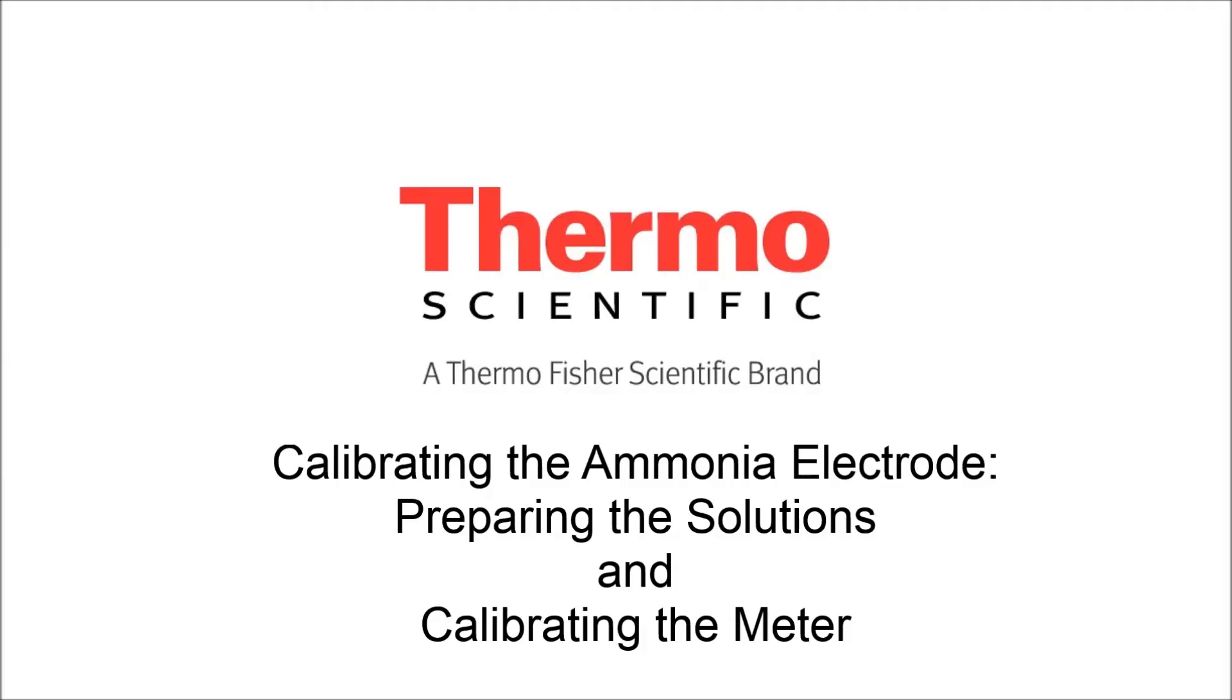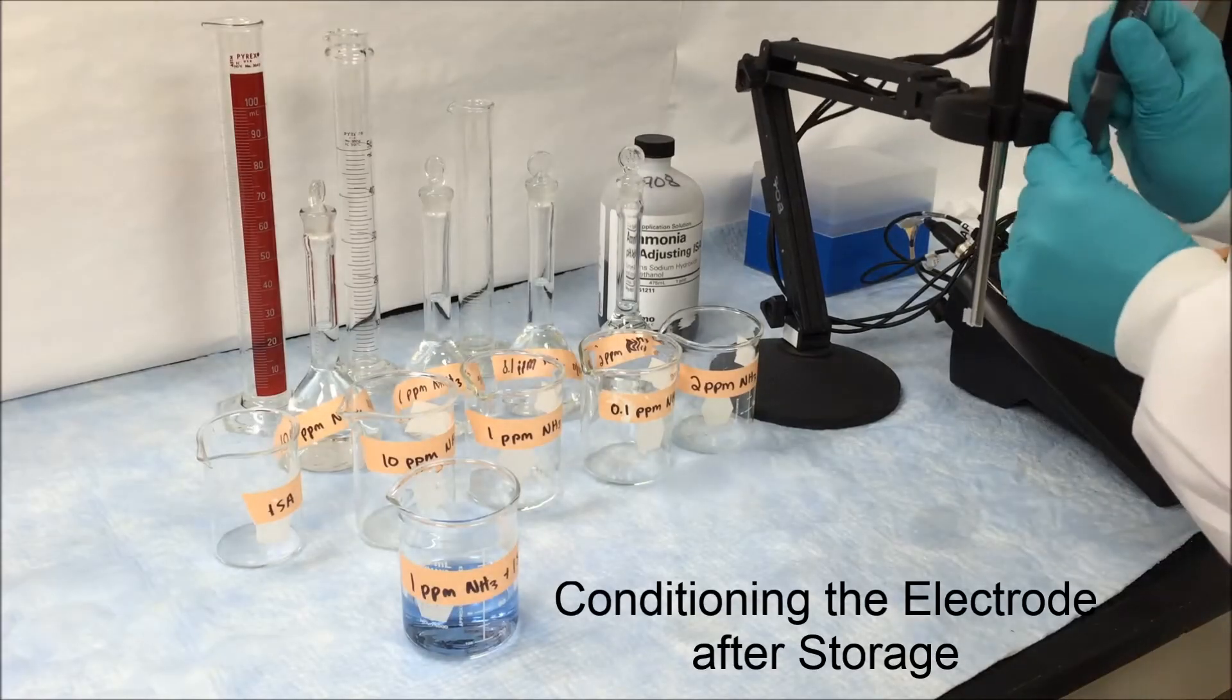Today we're going to discuss how to calibrate the ammonia electrode and prepare your solutions. First we want to start by conditioning our electrode after storing it.